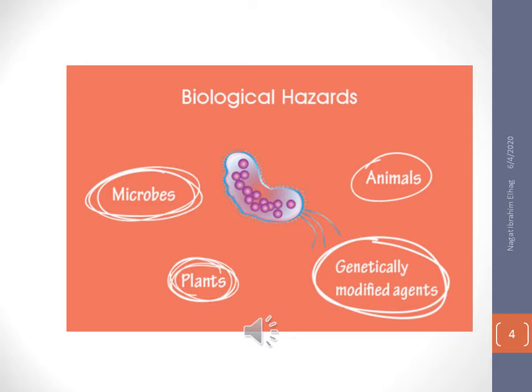When we work inside the cabinet, we make sure to decontaminate the area when we finish the work, by alcohol or by UV.